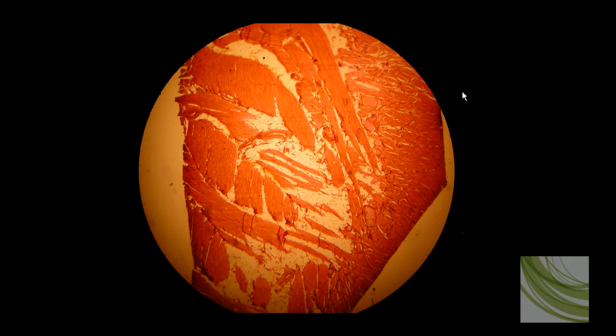Here is a slide using the 4X objective showing some skeletal muscle going in several different directions. I believe this is a slide of tongue muscle. We can't see a lot here at 4X, but these are some of the areas you would look for, as I'm pointing out, for skeletal muscle tissue.